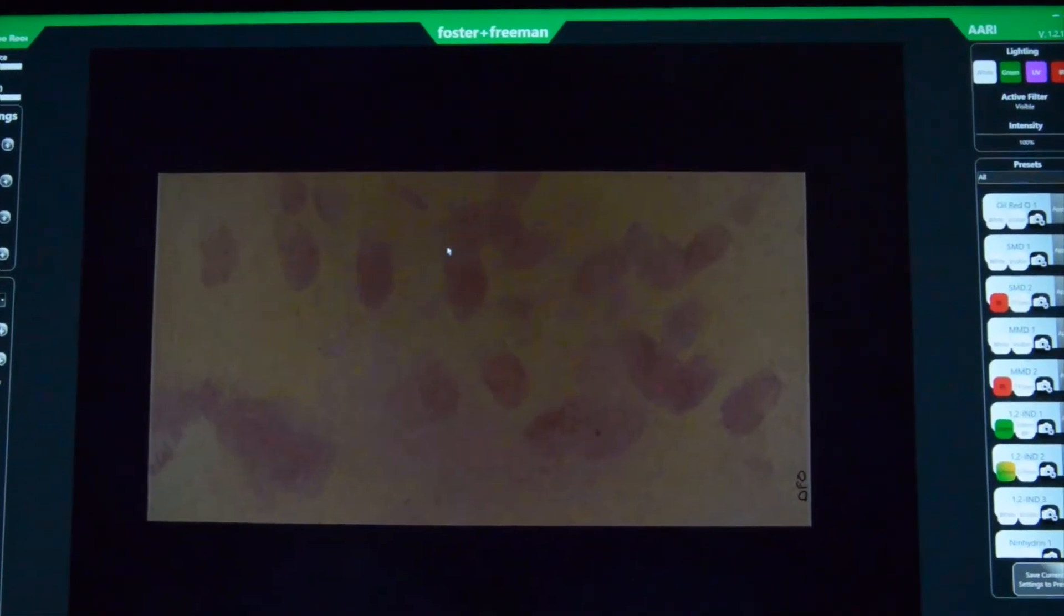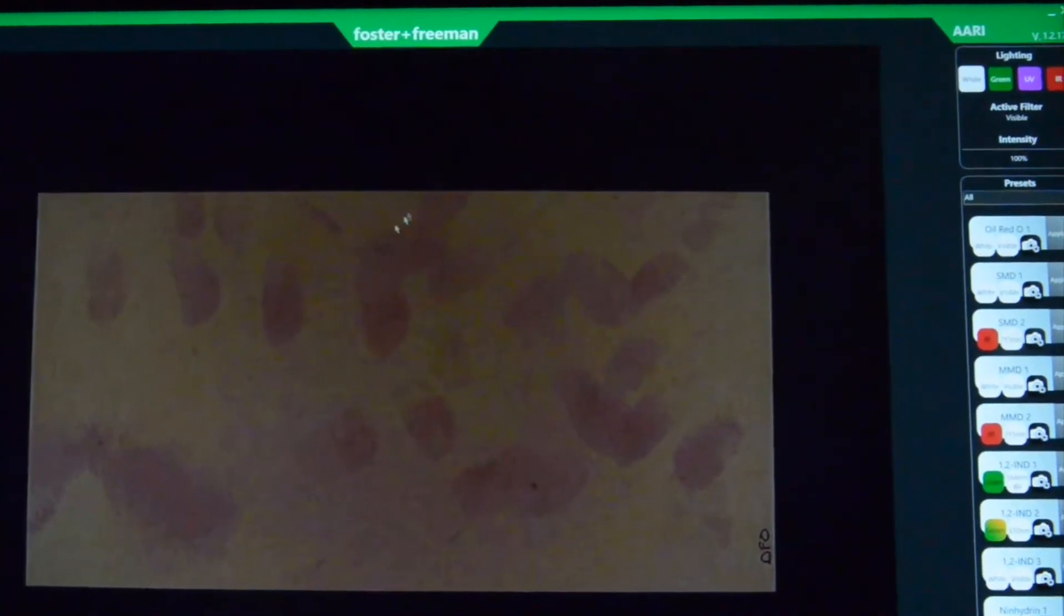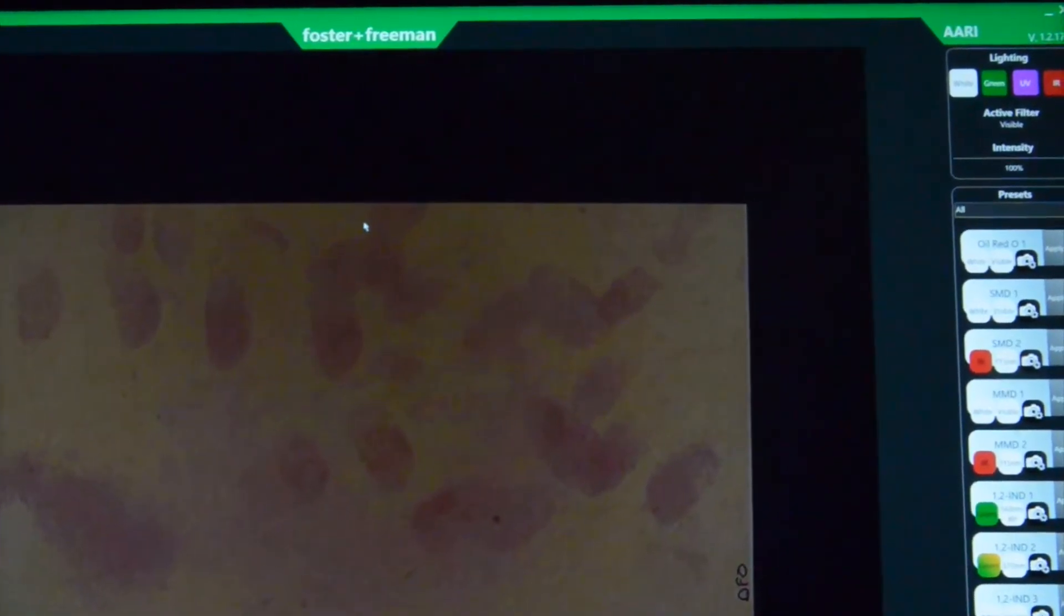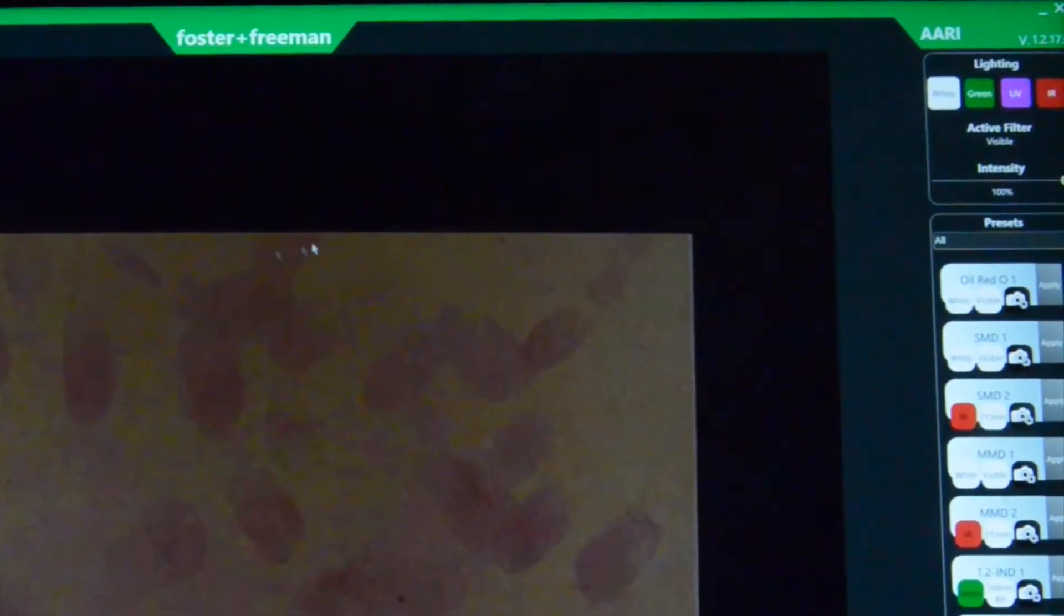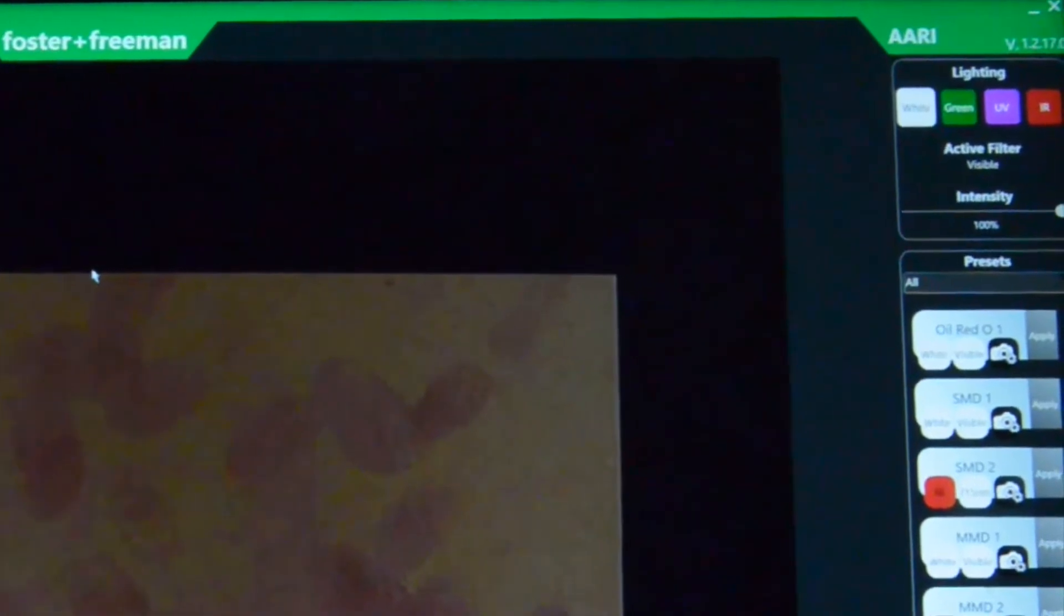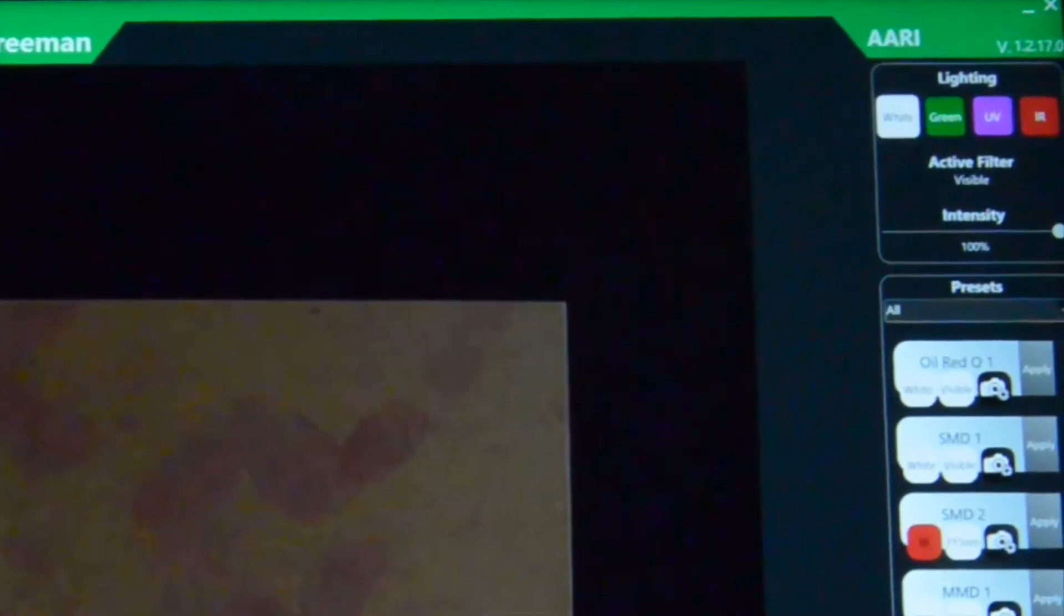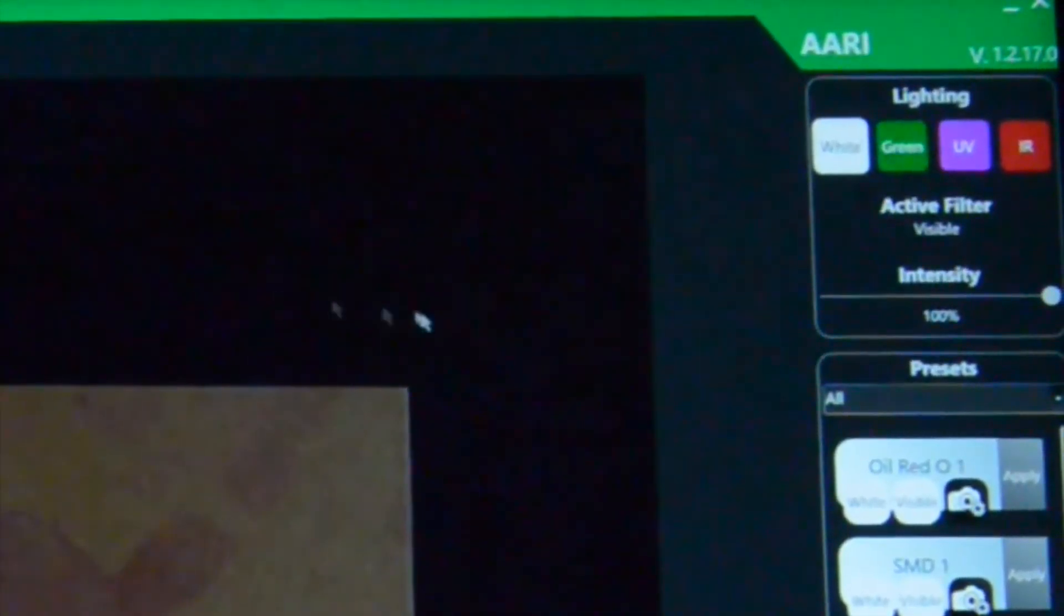So let's have a look at the software. If we go to the top right of the screen here, this is all of your controls for the different lighting and filter combinations that you might need for a variety of different treatments.